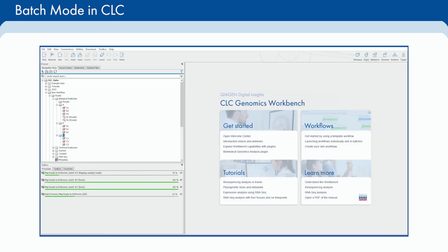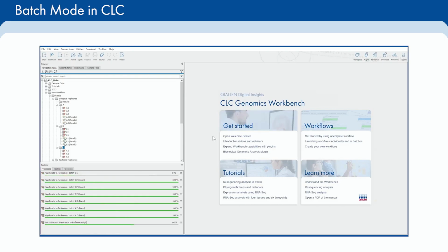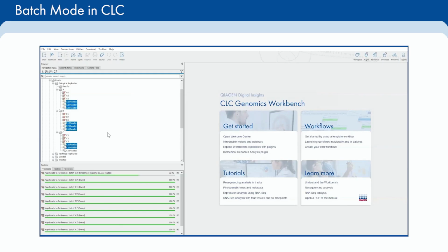The Processes tab lists which batch unit is running and how many samples are remaining. Notice how each file is processed independently and there is a corresponding output for each file. Once the work completes, we have 9 read mappings total, which is what we expect for this run.